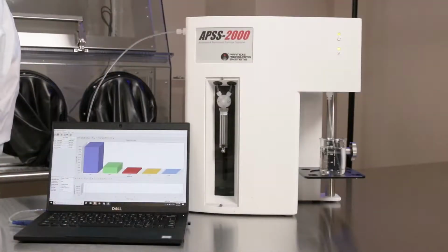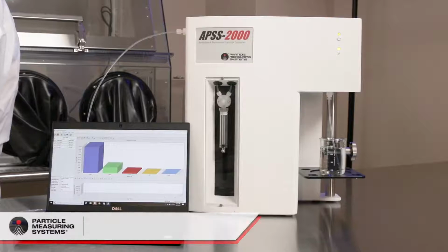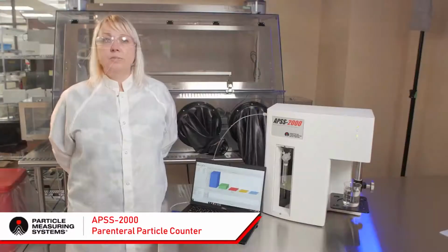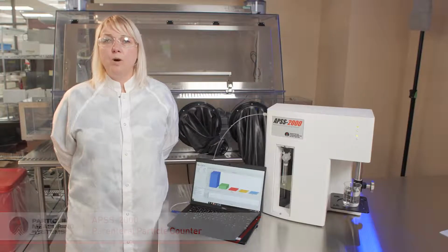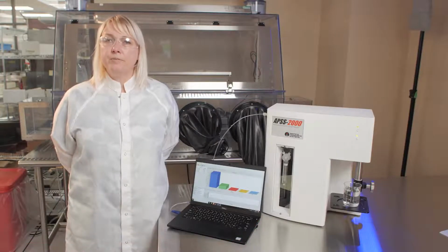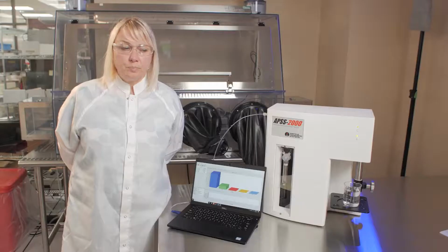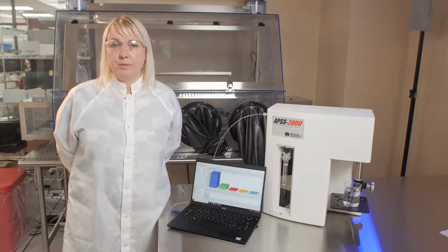Today I'd like to talk about our non-viable liquid particle counter, the APSS 2000. This is good for injectables, water for injection, medical device, parts cleanliness, optical solutions, and filter efficiency testing. So how do we count particles?